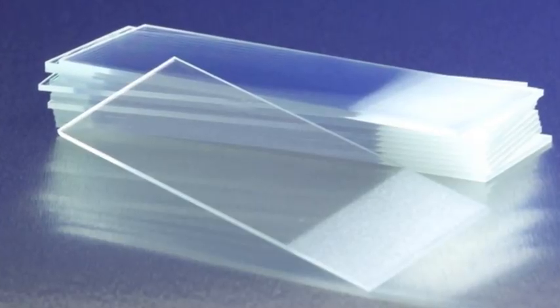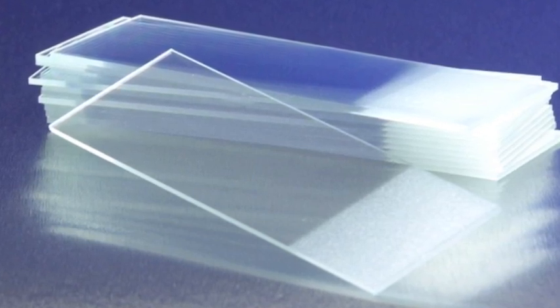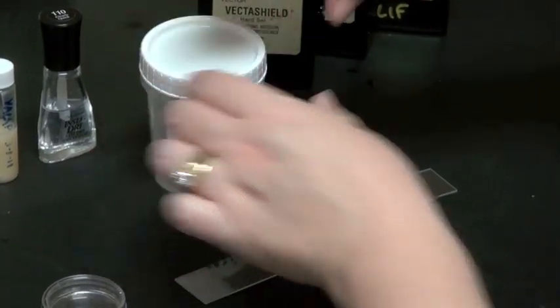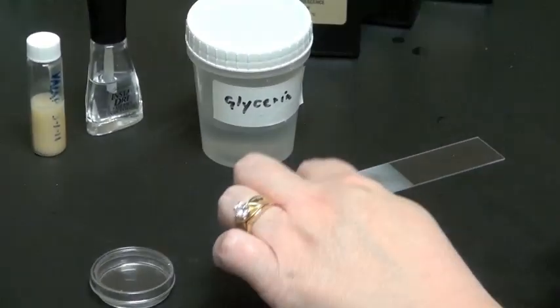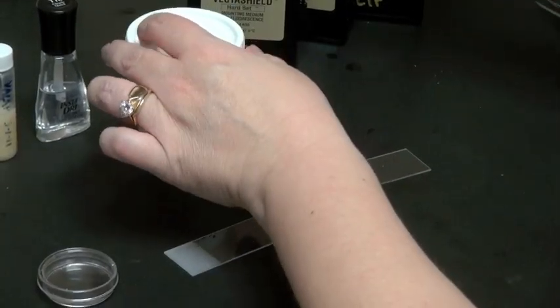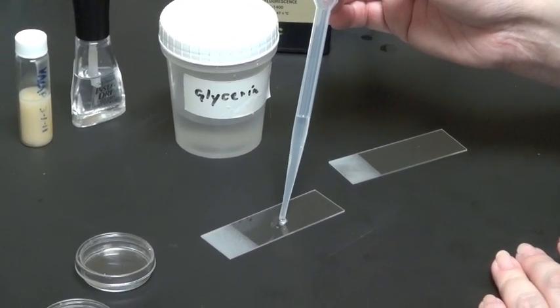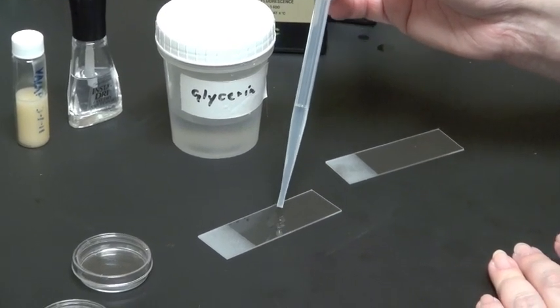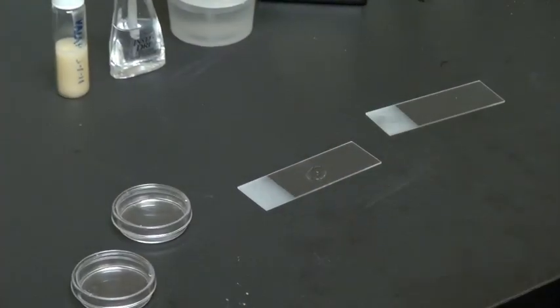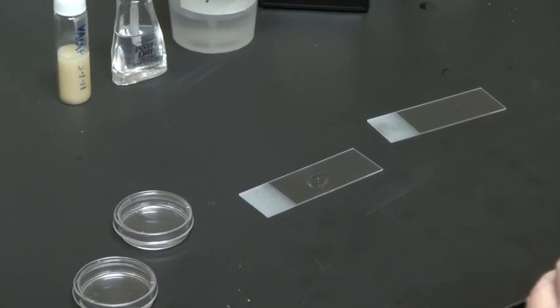I like frosted slides so that I can use a pencil to identify what's on my slide. You're going to want to use pencil because even permanent marker comes off with ethanol. So the first thing that you have to do is put your mounting media onto your slide itself. And you want to try not to get too many bubbles when you're doing this. So make sure that you have enough so that you don't have air spaces underneath your cover glass when you put it onto the glass slide.